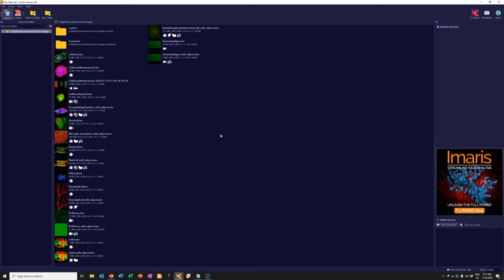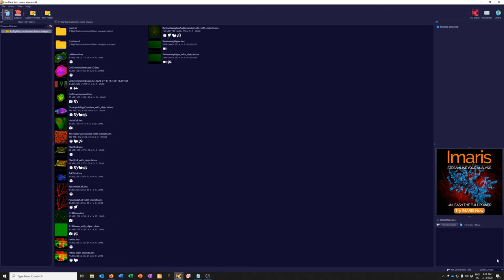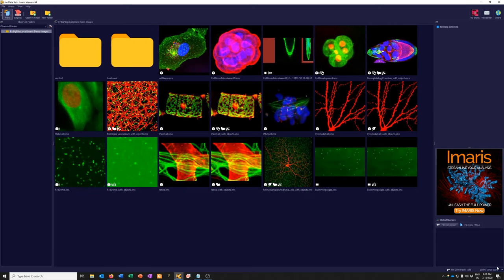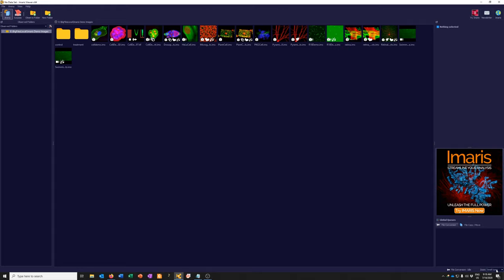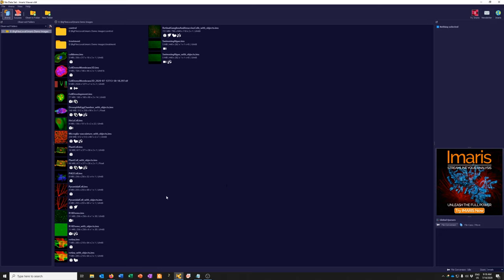If you don't like the way these icons look and prefer to explore a different way of viewing your data, you can go down here to Zoom. You can choose compact details, large icons, small icons, medium icons, etc. You can explore that and display your data sets however is most comfortable to you.